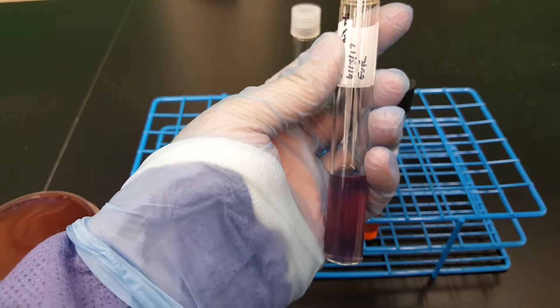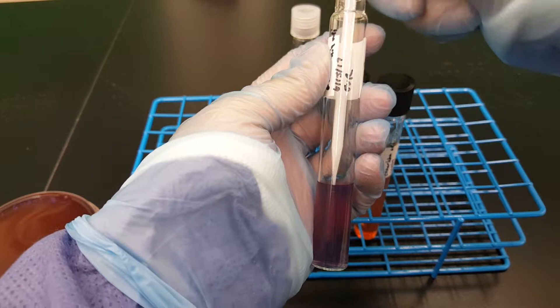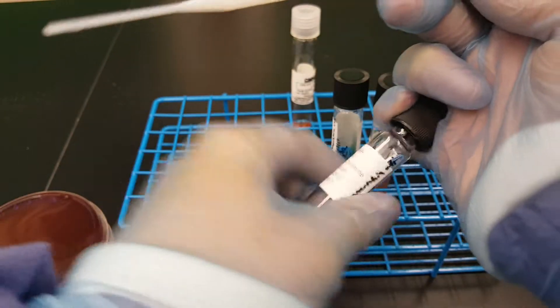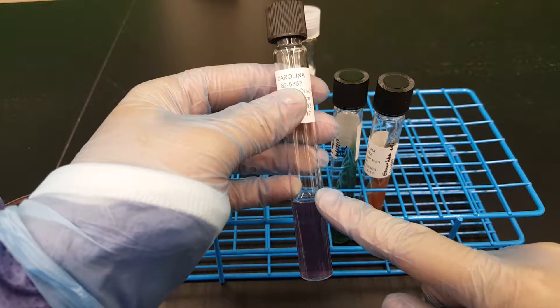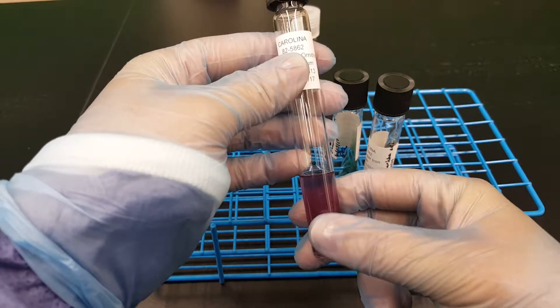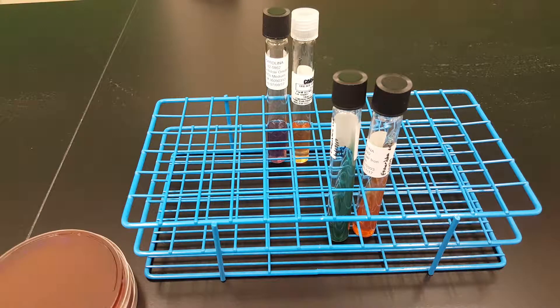I'm going to put it down here. Try to do a single stab line, and again you're going to turn it back a half a turn. We put the indole reagent on after incubation, not before, because you need to give the organism time to break down the amino acid that's in the agar.